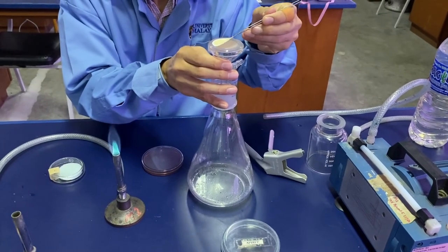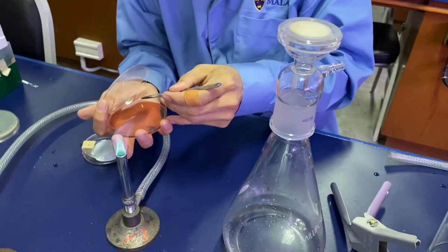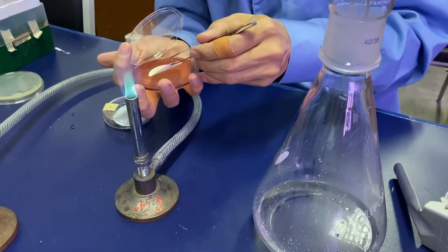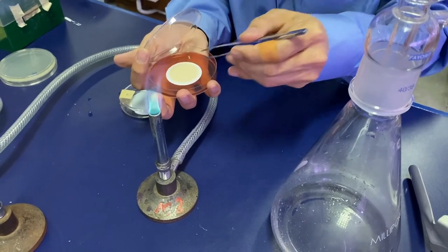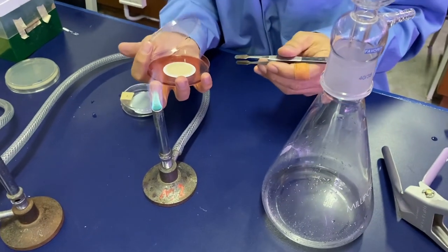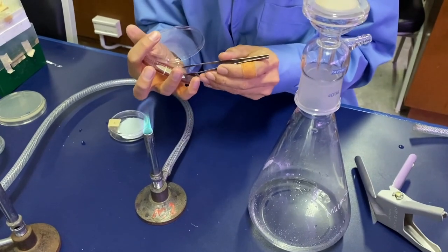Gently lift the membrane filter and then place it slowly onto the agar plate, carefully trying not to trap any bubbles under the membrane filter.